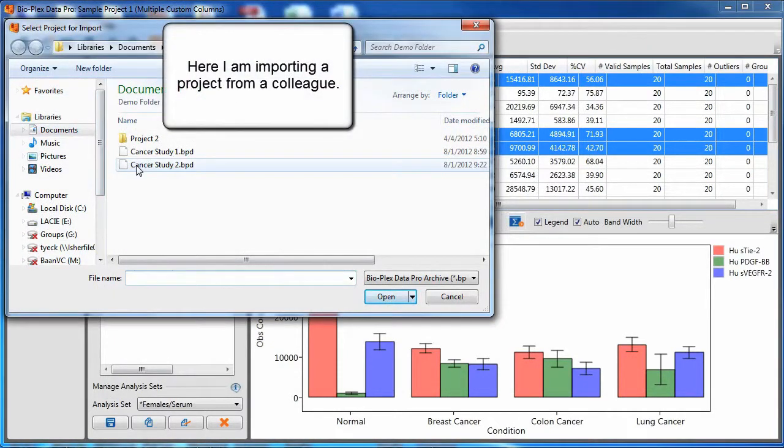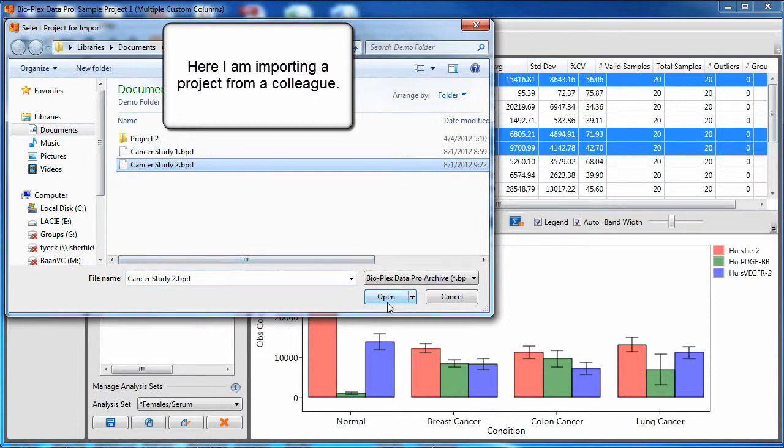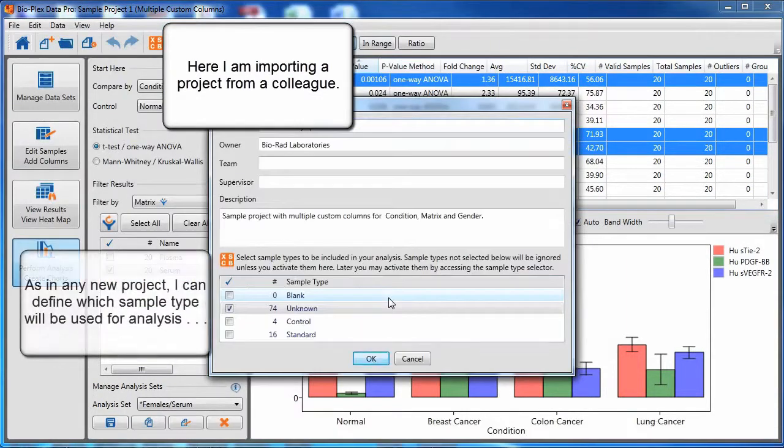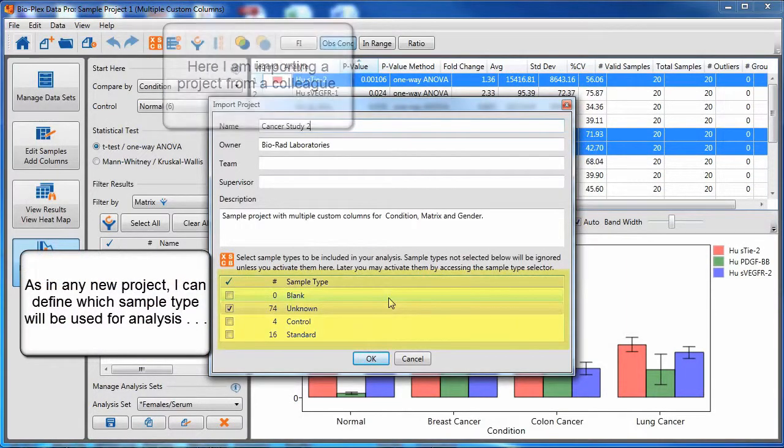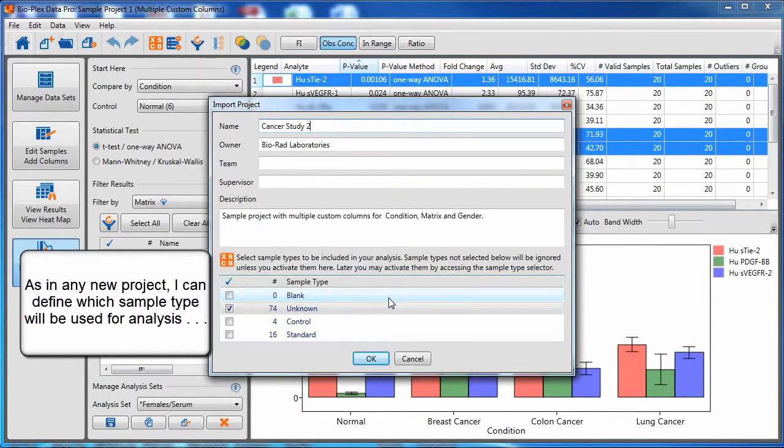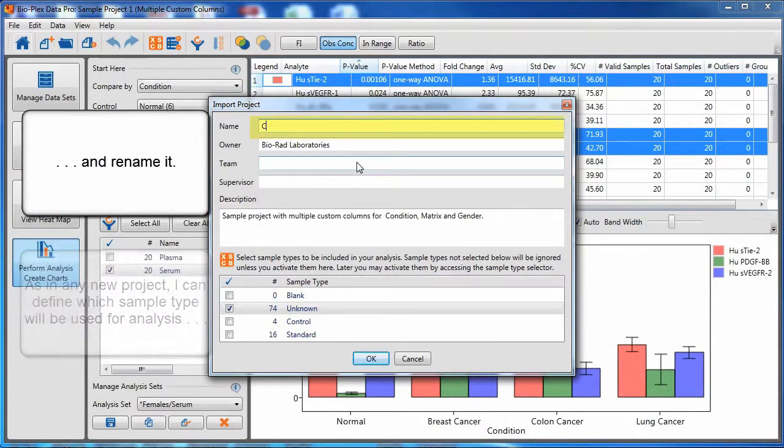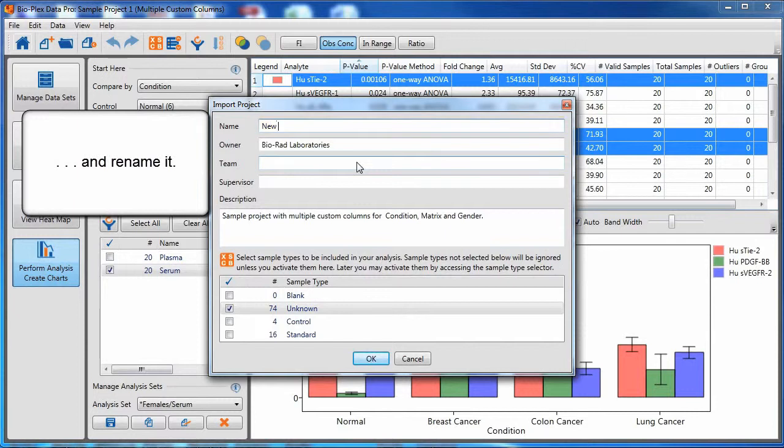Here, I am importing a project sent to me by a colleague. As in any new project, I can define which sample type will be used for analysis, and I can rename the project.